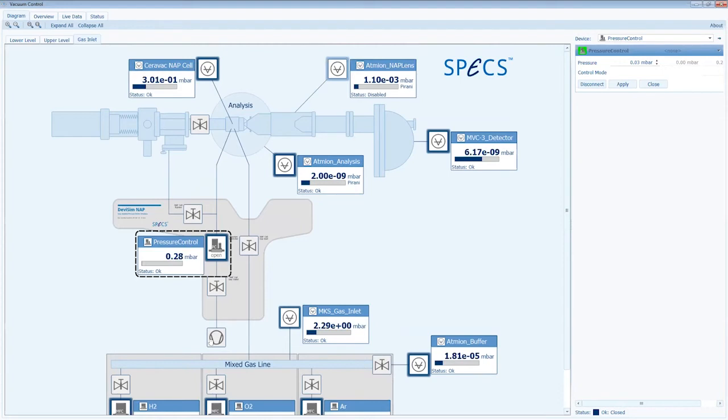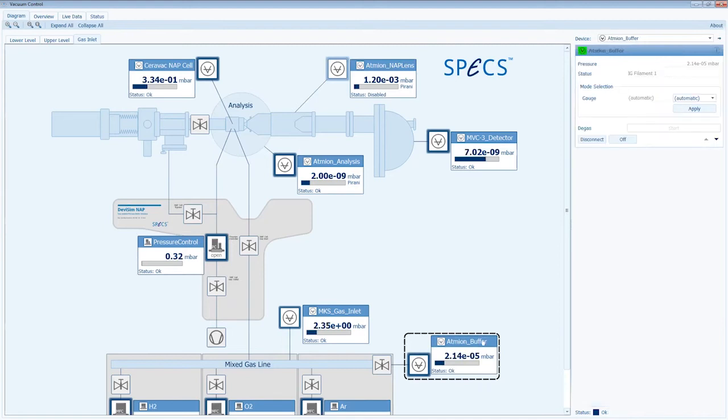And it is pumped to some pump. However, the gauge is here, connected to some buffer chamber with a turbo pump. So all gas which goes to the cell is pumped or goes to the analyzer. There is a problem. We have burned the gauge for the NAP lens first stage, so we don't know exactly the pressure. There is only a Pirani gauge, which shows just the minimum pressure of 10^-3. However, I think there should be around 10^-6 now, because there is usually a 5 orders of magnitude difference between the pressure inside the cell and the pressure in the first pumping stage.